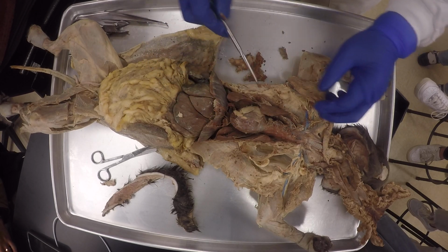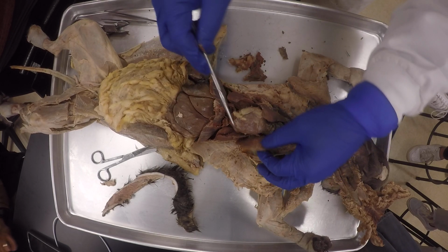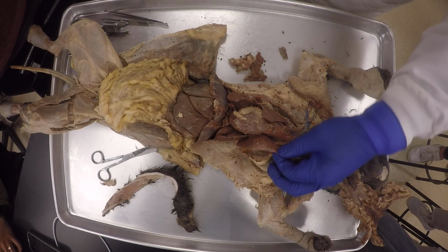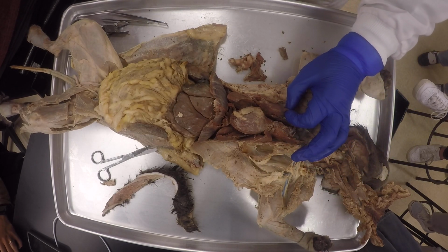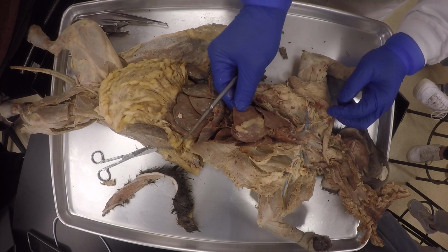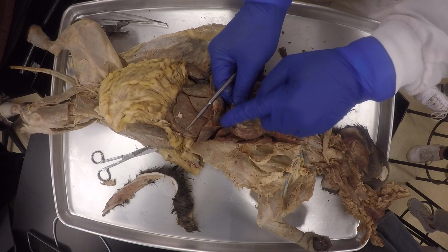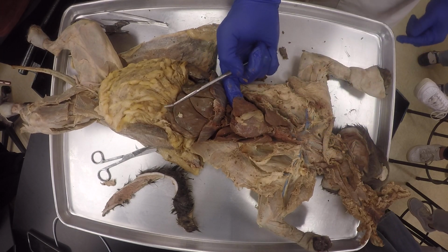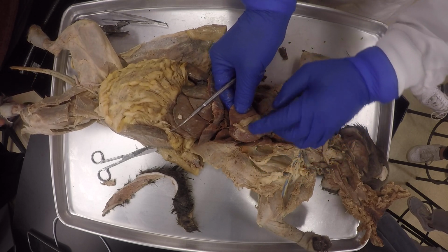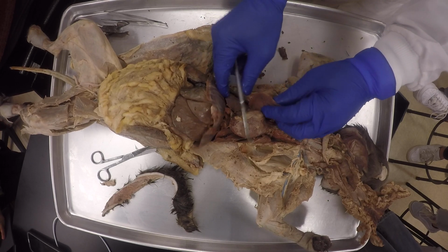So is it on? Yes, it's on. Of course, this would be the left apical lobe, right apical lobe, and look here. What is this? Look. The right cardiac lobe. Can't you see it's wrapping around the heart like that?